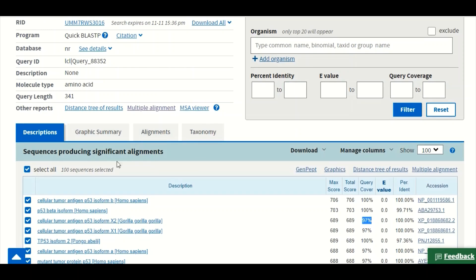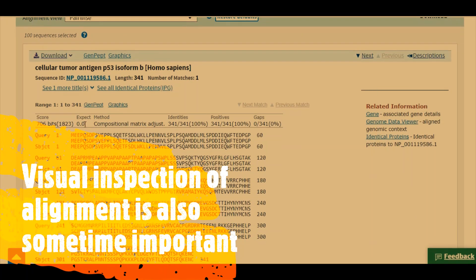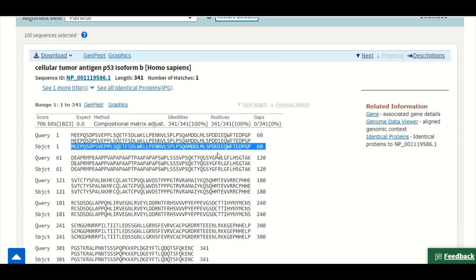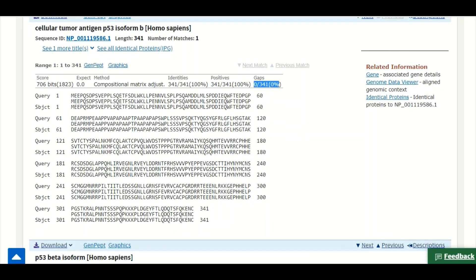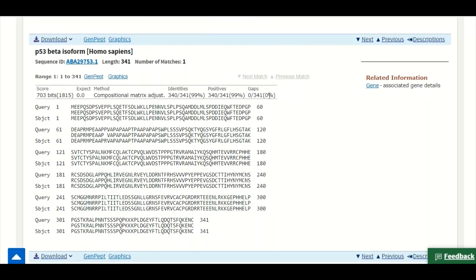You can also view the alignment of your query sequence with database sequences by clicking the alignment button. Here you can see your query sequence aligned with the database sequence showing 100% identity, 0% gaps. The second alignment shows 99% identity with no gaps, meaning there is one substitution somewhere in the alignment. You can look through the alignment to find that substitution.